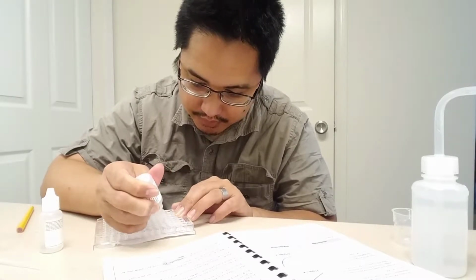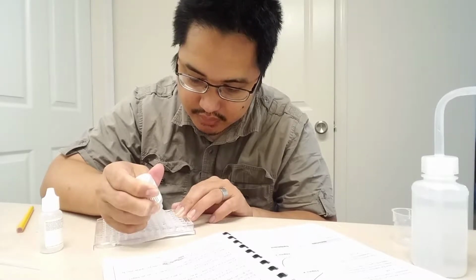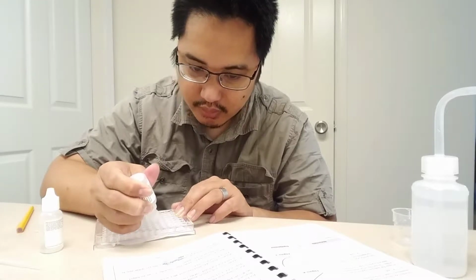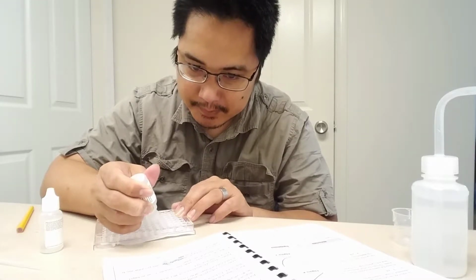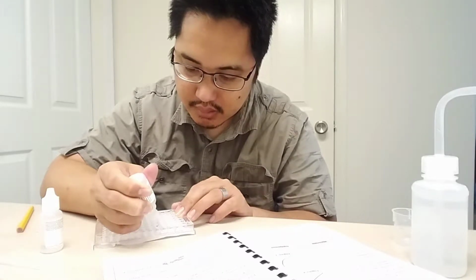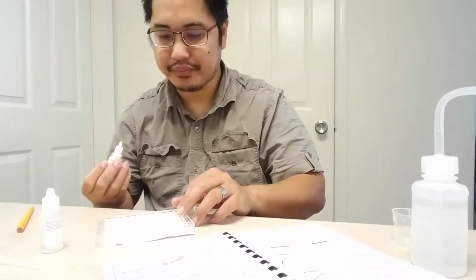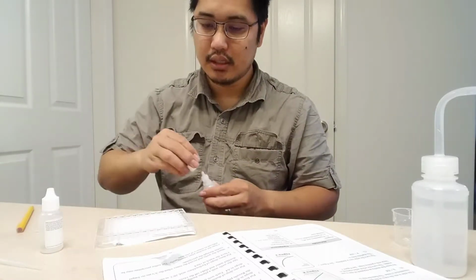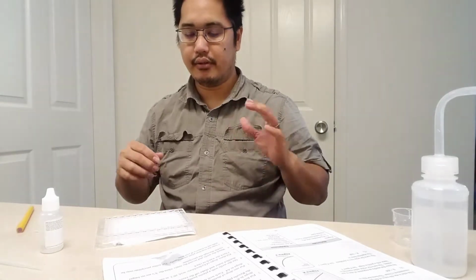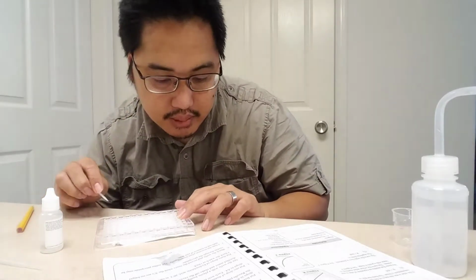Okay, I'll put 3 in here, and 4 in well A5: 1, 2, 3, 4. Okay. So now each well should have exactly 5 drops in it, and they all look about the same.